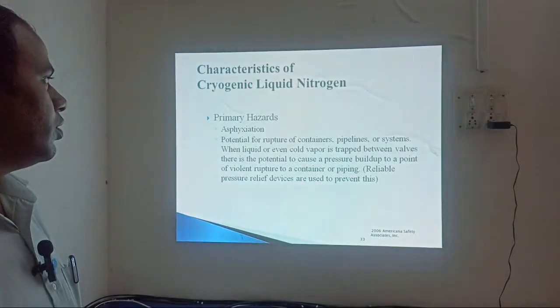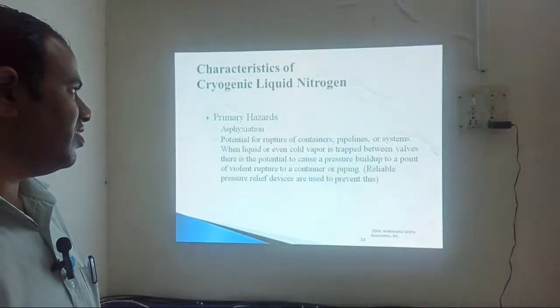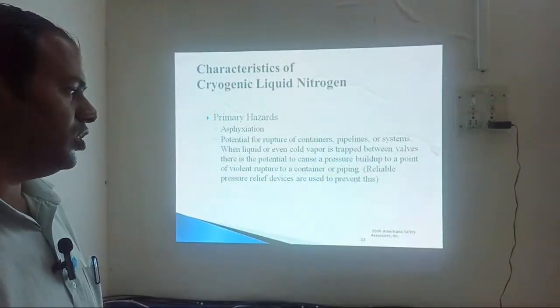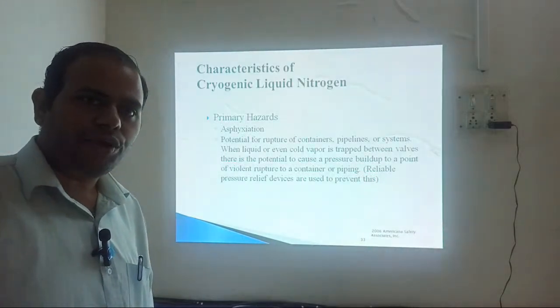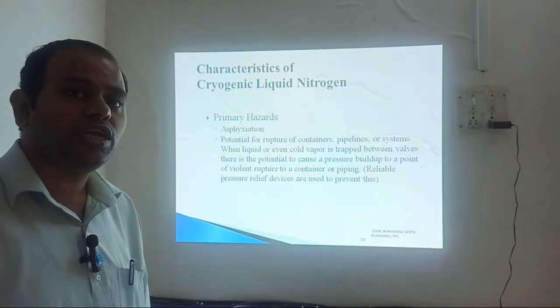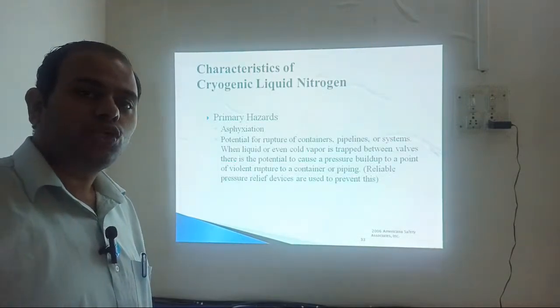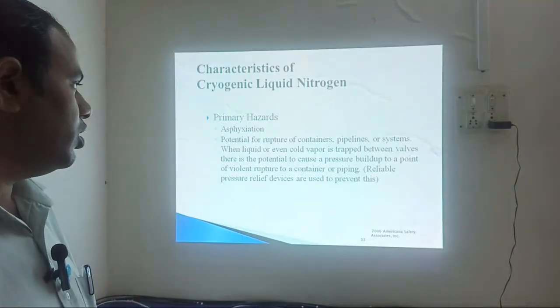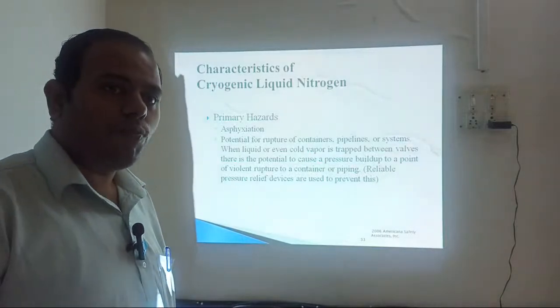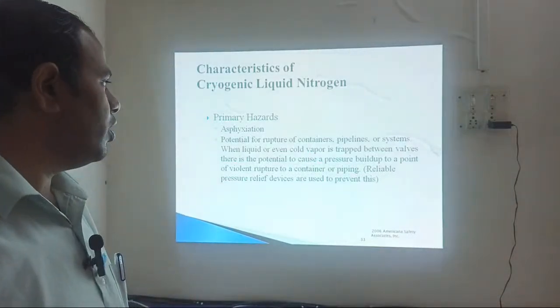See, I have already told you the different primary hazards that liquid nitrogen can cause. Generally, liquid nitrogen is stored in a very specific cryogenic container. Okay, you cannot store liquid nitrogen in any container. It has to be stored in a certified liquid nitrogen cryopreservation container. Okay, so proper filling of this container also should be done by a trained person.